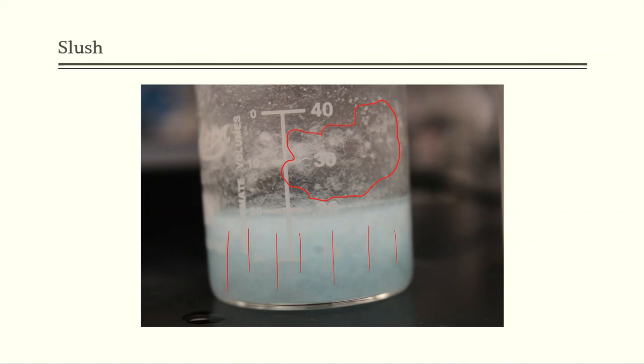That means I am recovering the majority of my product back. But once more, I still see that blue solution that's going to be there. So I'm hoping at this point that when I begin to filter this solution, all of the blue will go through and I'll be left with just white crystal, and that's it.